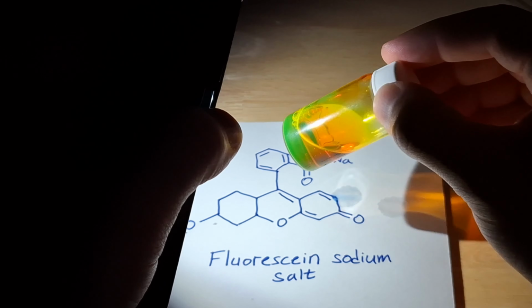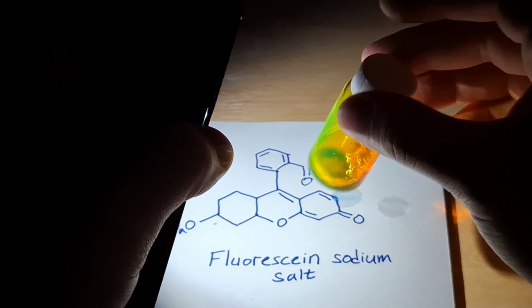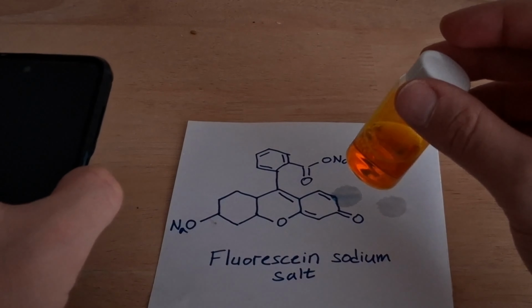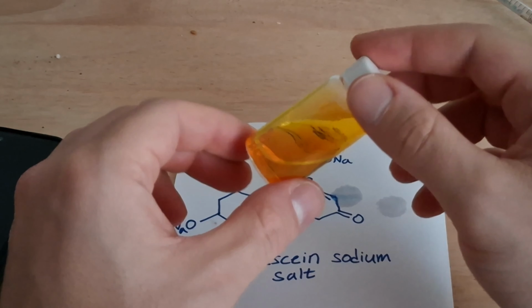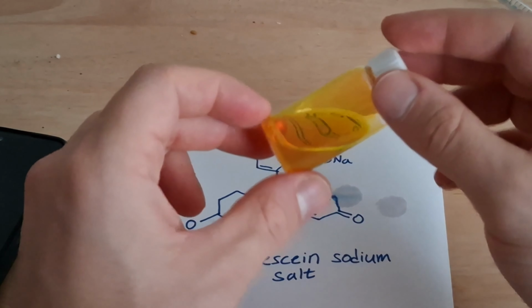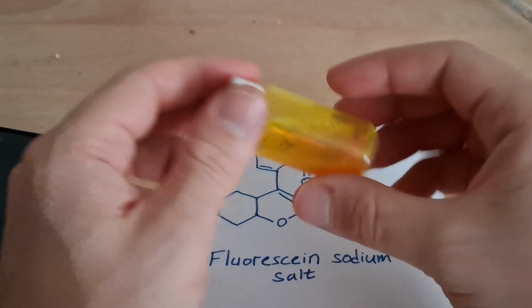So this is, I think, very interesting. What happens is that the solution suddenly shines bright green. This is a photoluminescence process, the process where a material absorbs light and energy. So light is an energy, and it re-emits as a different color. So therefore this is a very interesting phenomenon.